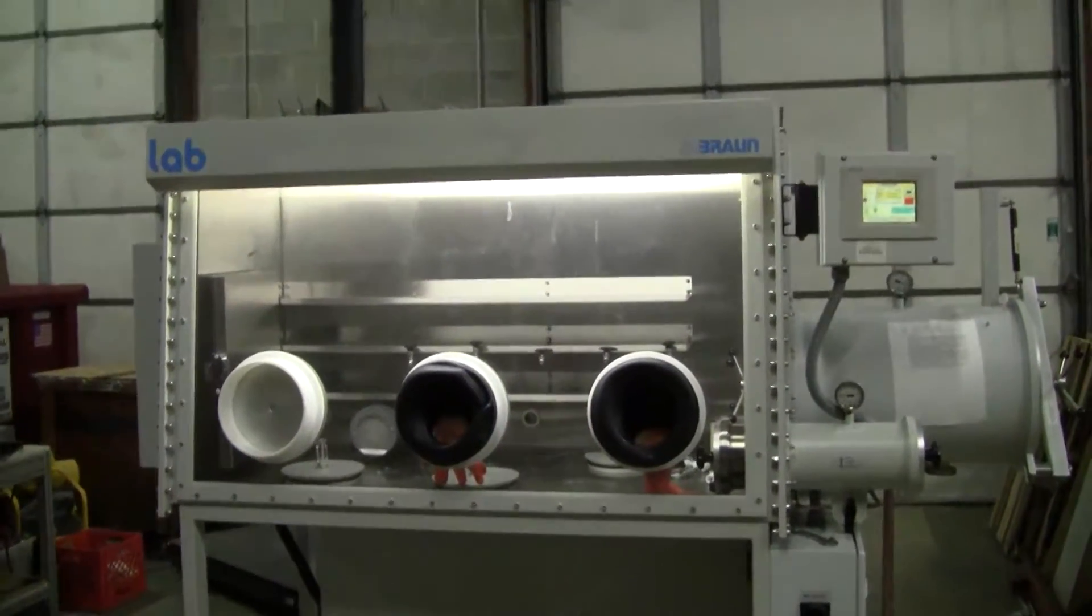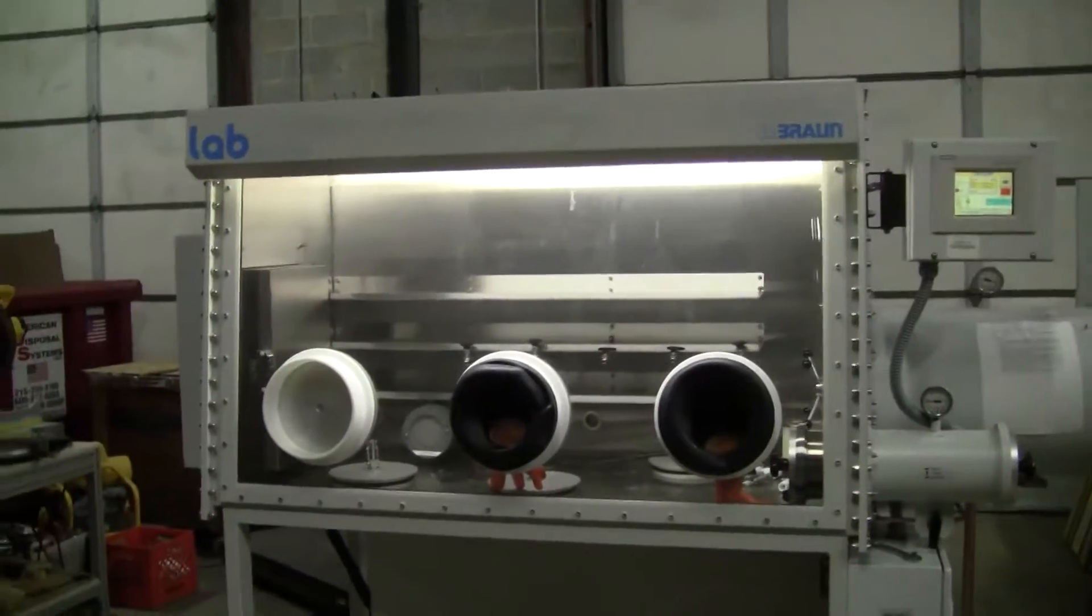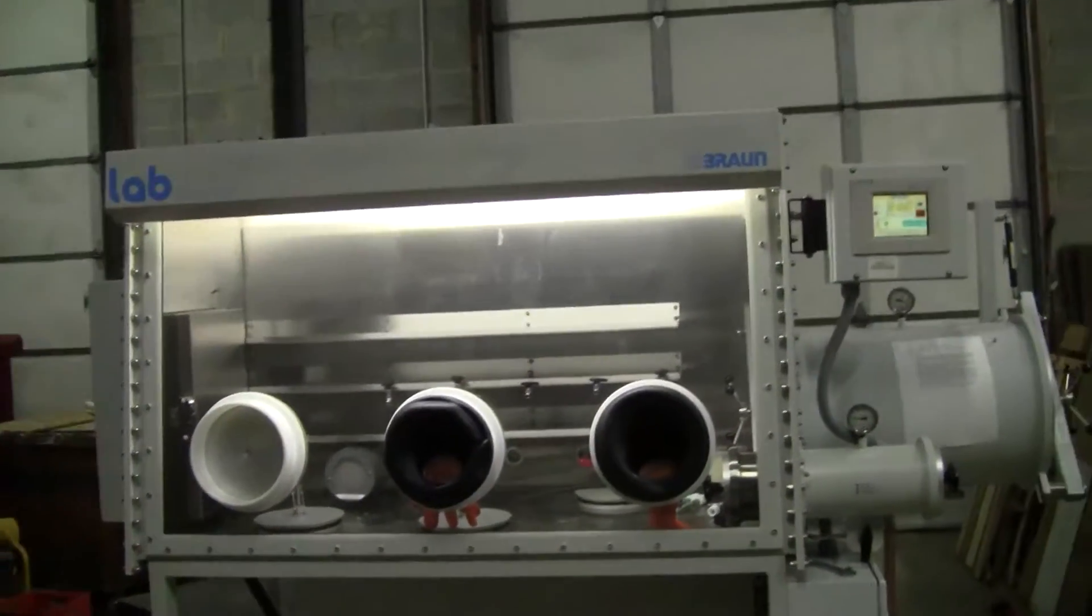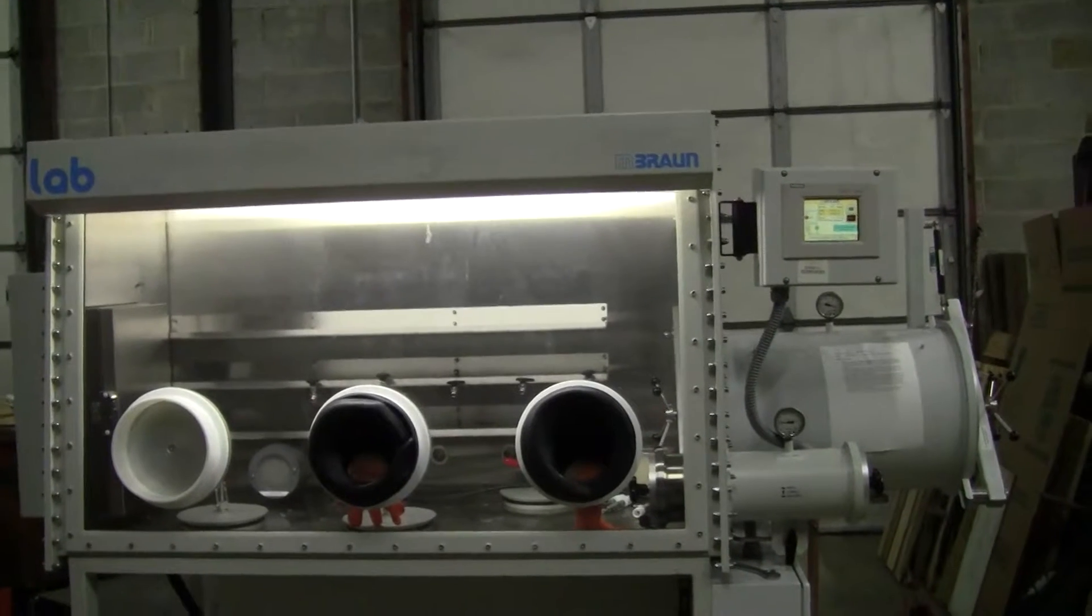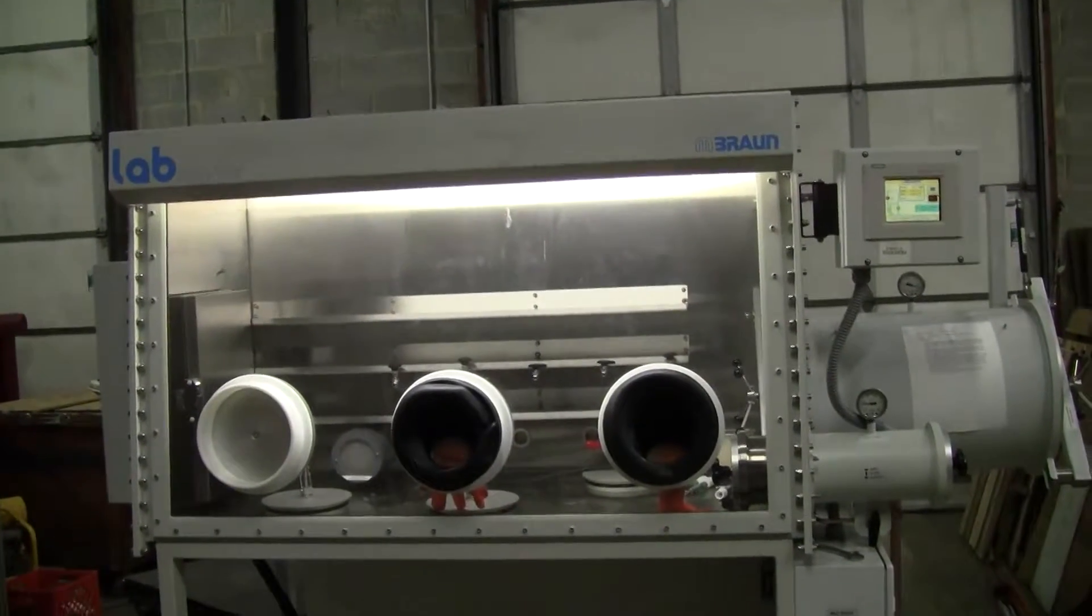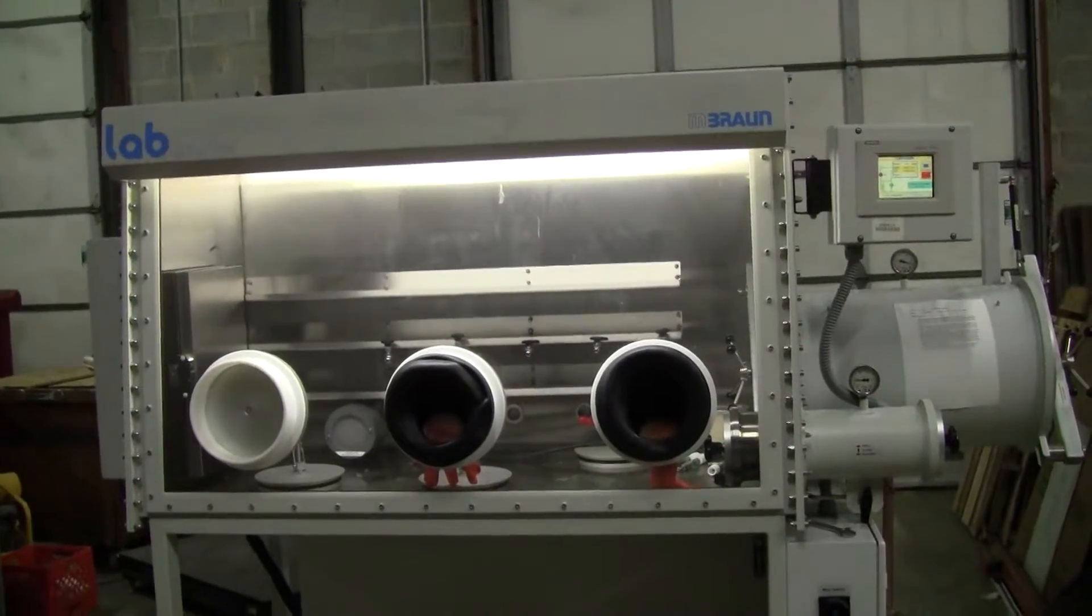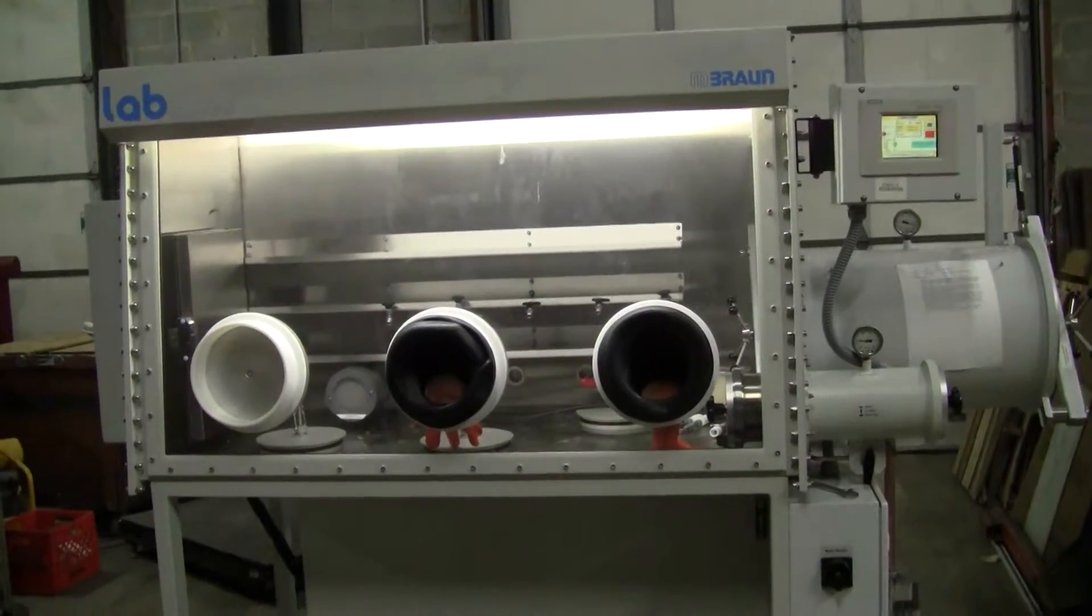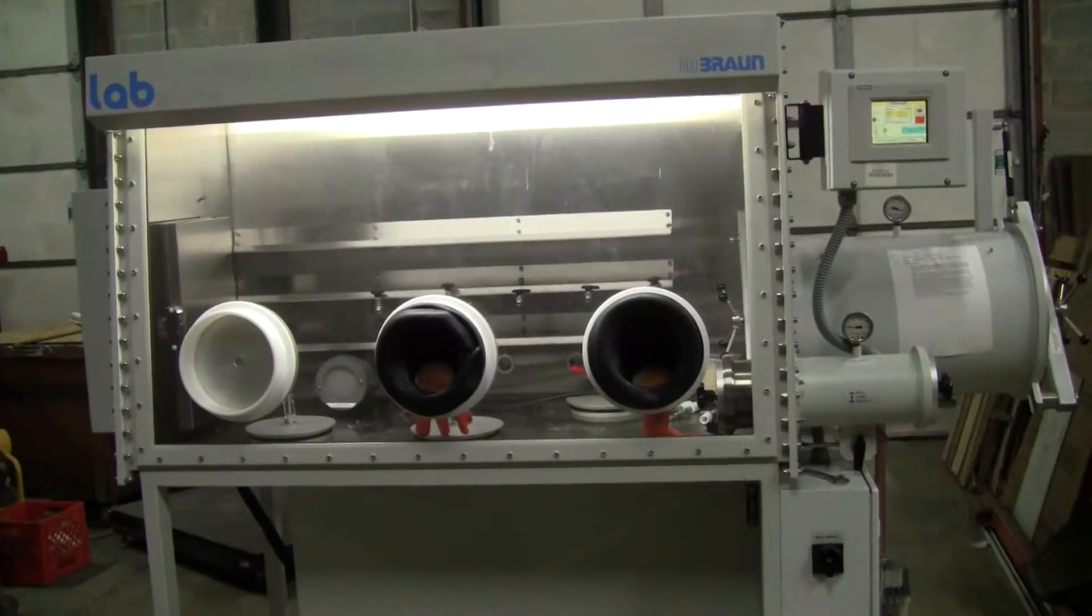Hi, this is Michael from Hitech Trader. Today we're looking at a Labmaster 130 manufactured by MBraun. This is a three-port glove box.